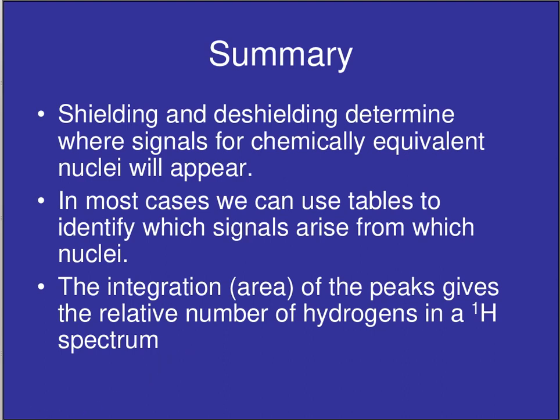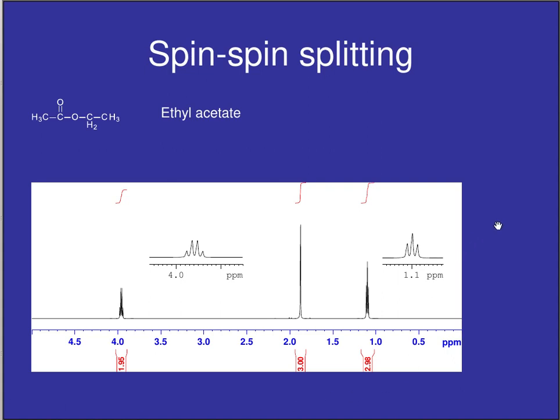Okay, but there is a third area of information that comes from NMR, and I think the power of NMR comes from this third area. Have a look here, look very carefully here. This is a spectrum of ethyl acetate, a proton spectrum of ethyl acetate, and simply by looking at chemical shifts, we can see that this signal over here must be the CH2 that's next to an oxygen, but we have two CH3s, and it would be interesting to see if we can distinguish between them.